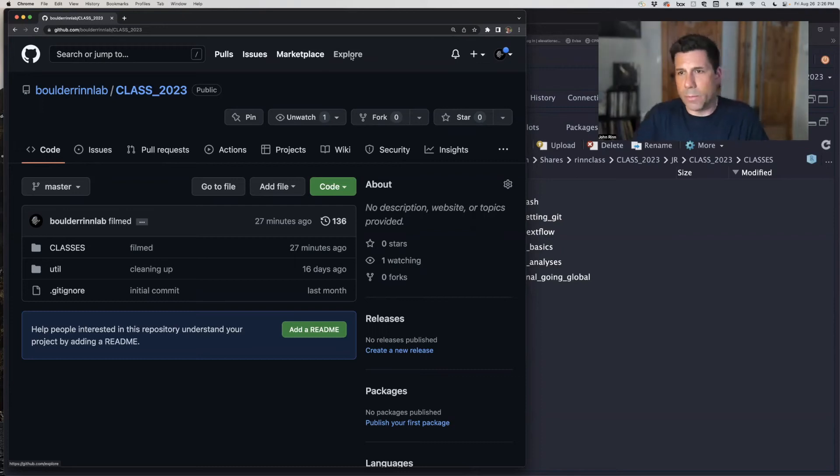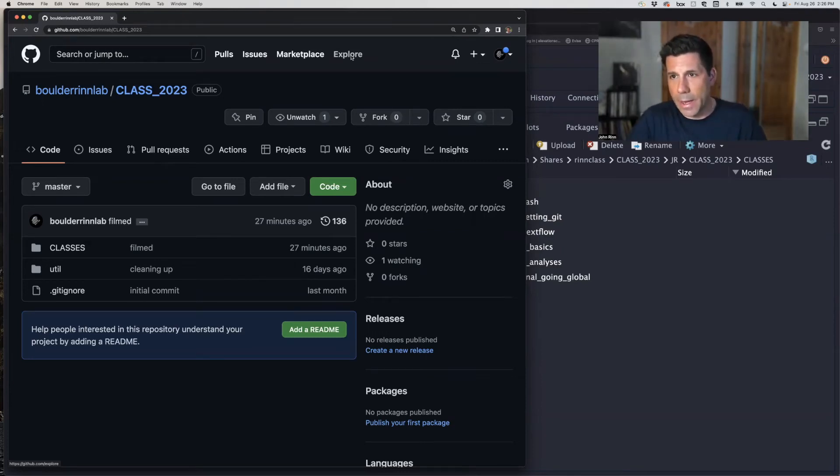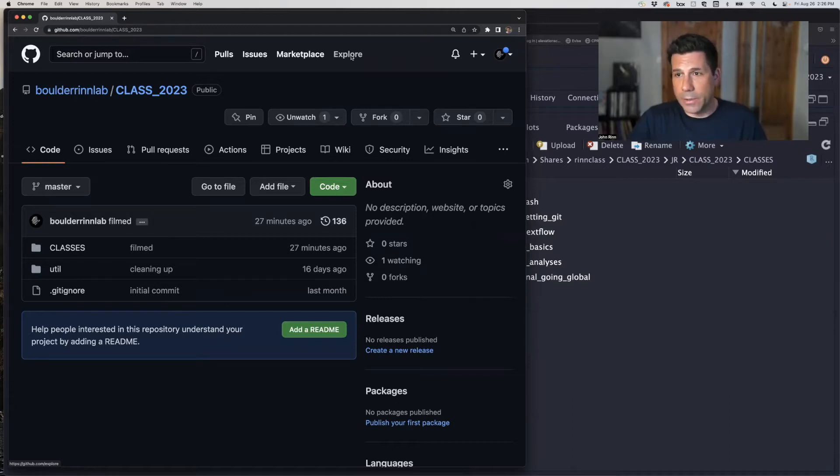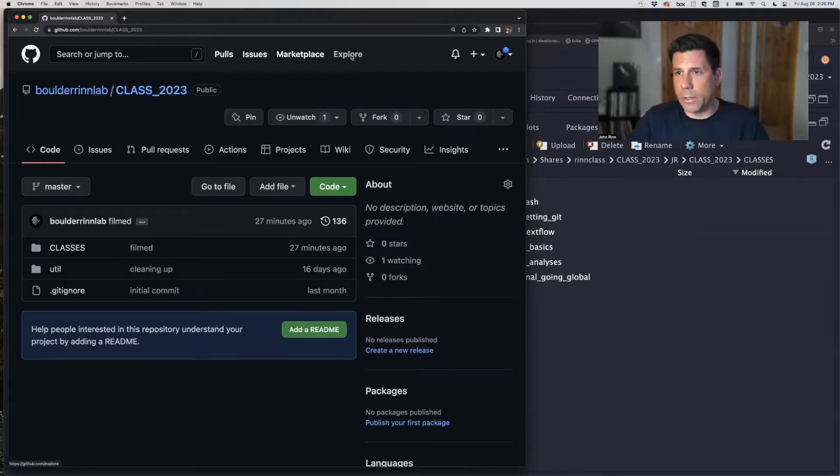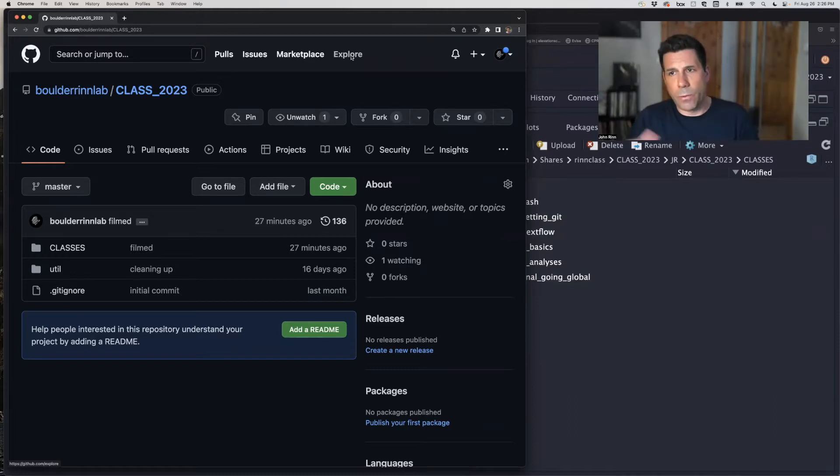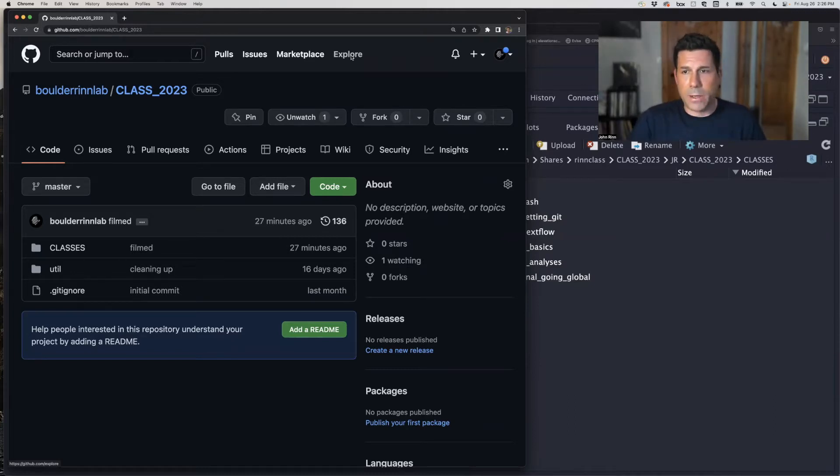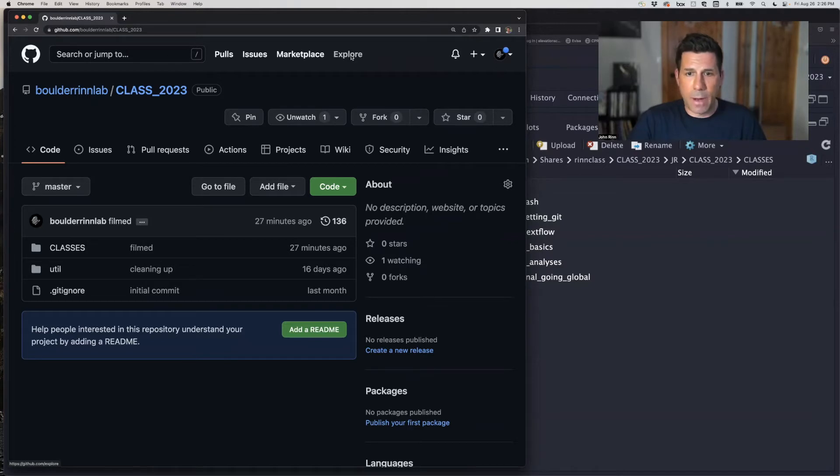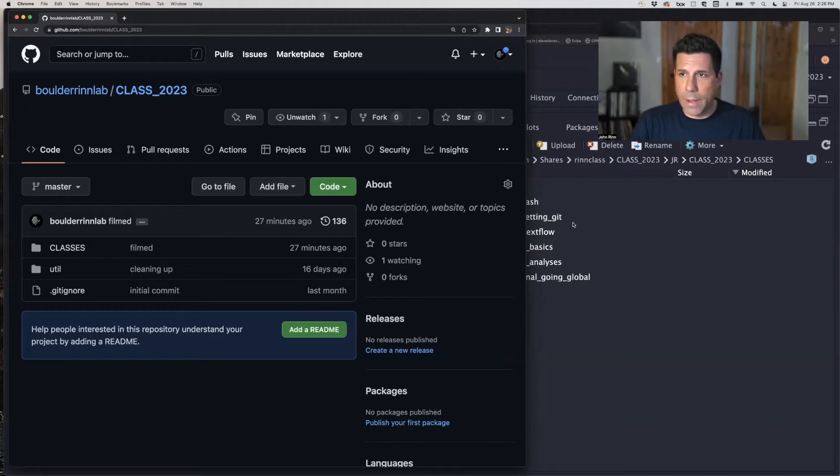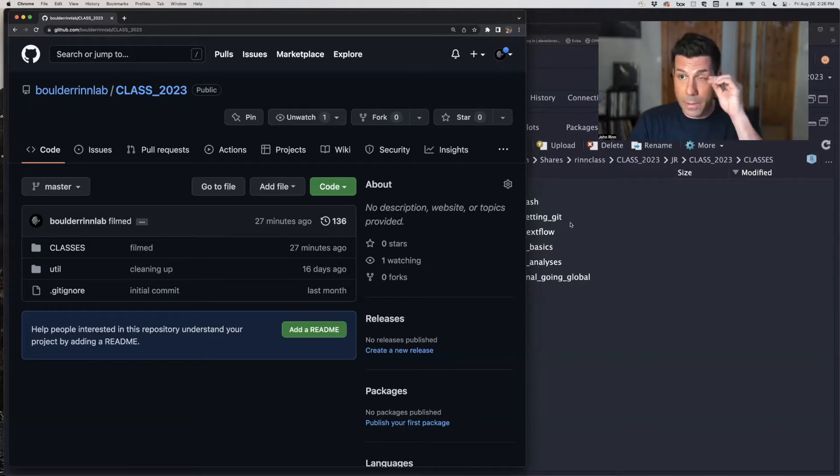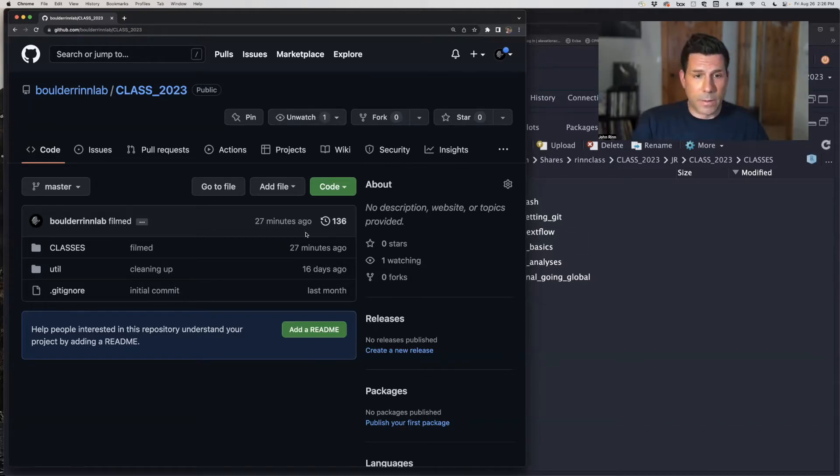Hello, everybody, and welcome to our class on the ChipSeq pipeline output. Congratulations, you're probably here because you ran your first ChipSeq and you want to see what you got out of there. I've been saying there's lots of analyses done, quality controls, and so we're just going to briefly go through some of the main highlights of that.